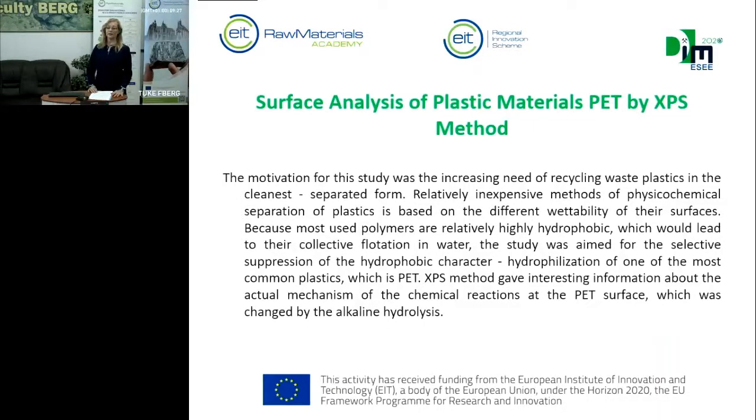terephthalate. The XPS method gave interesting information about the actual mechanism of the chemical reactions at the polyethylene terephthalate surface, which was changed by the alkaline hydrolysis.